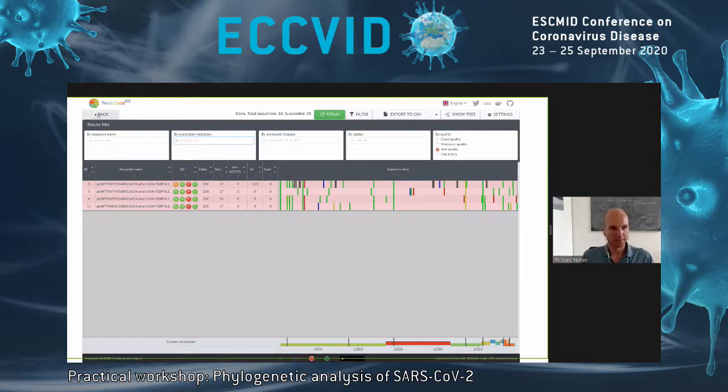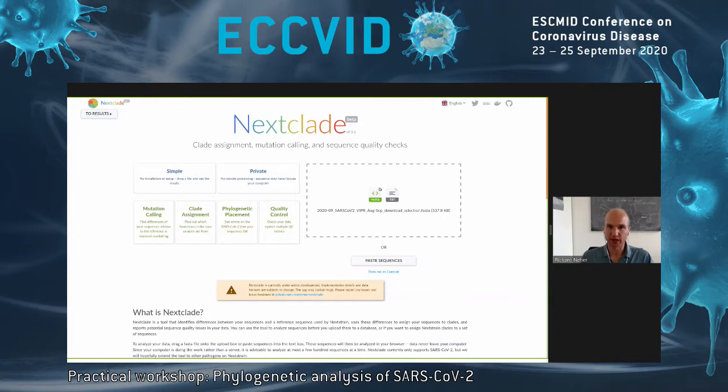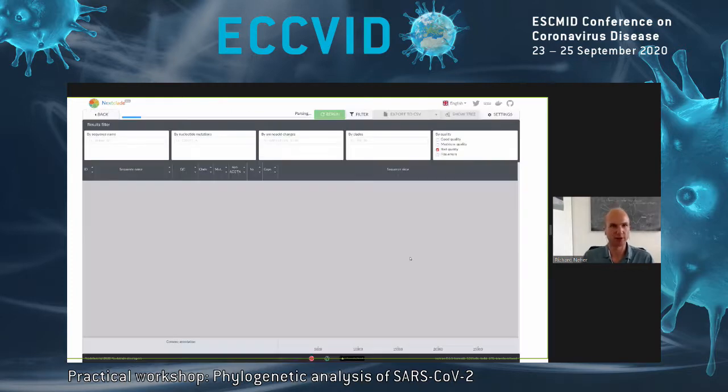Good. I was just going to analyze the bigger data set too, which is about 10 times bigger than the one we just did, and I'll get this started right now. Again, you click on this field, you either drop a file there or click and select this file, and it starts doing its thing right away. In this case, it's 161 sequences.